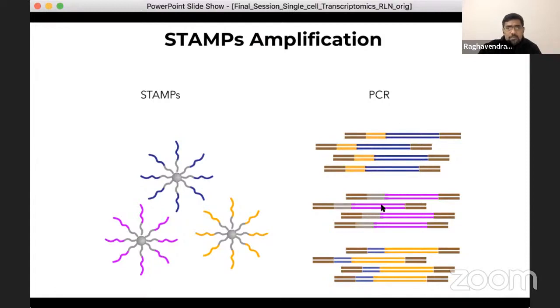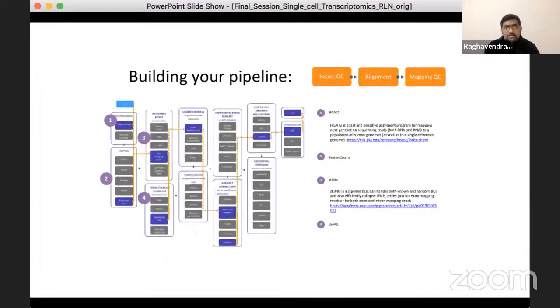For sequencing and analysis, the resulting molecules are sequenced using high capacity parallel sequencing, and the reads are first aligned to a reference genome to identify the gene of origin of the cDNA, and then the reads are organized by their barcodes.